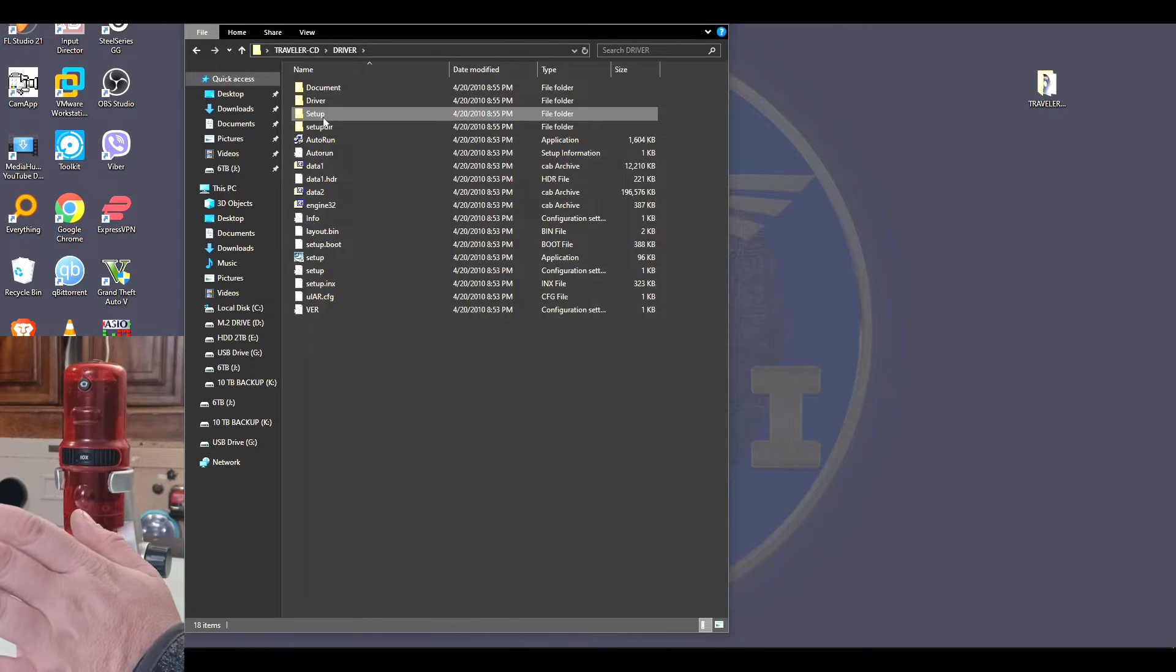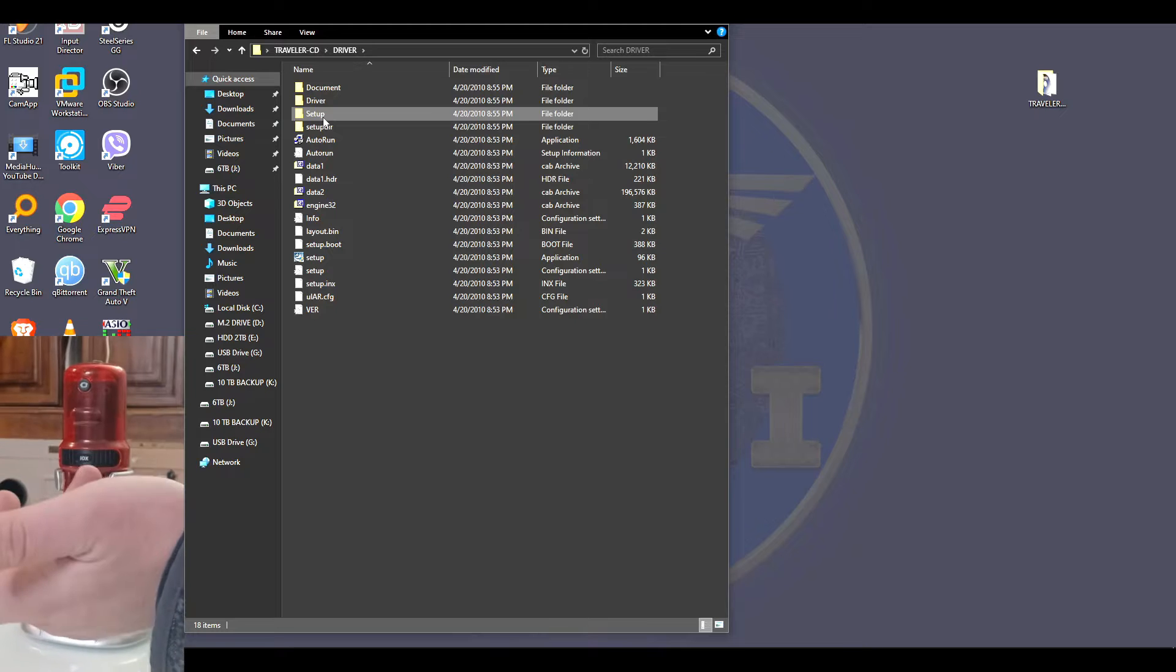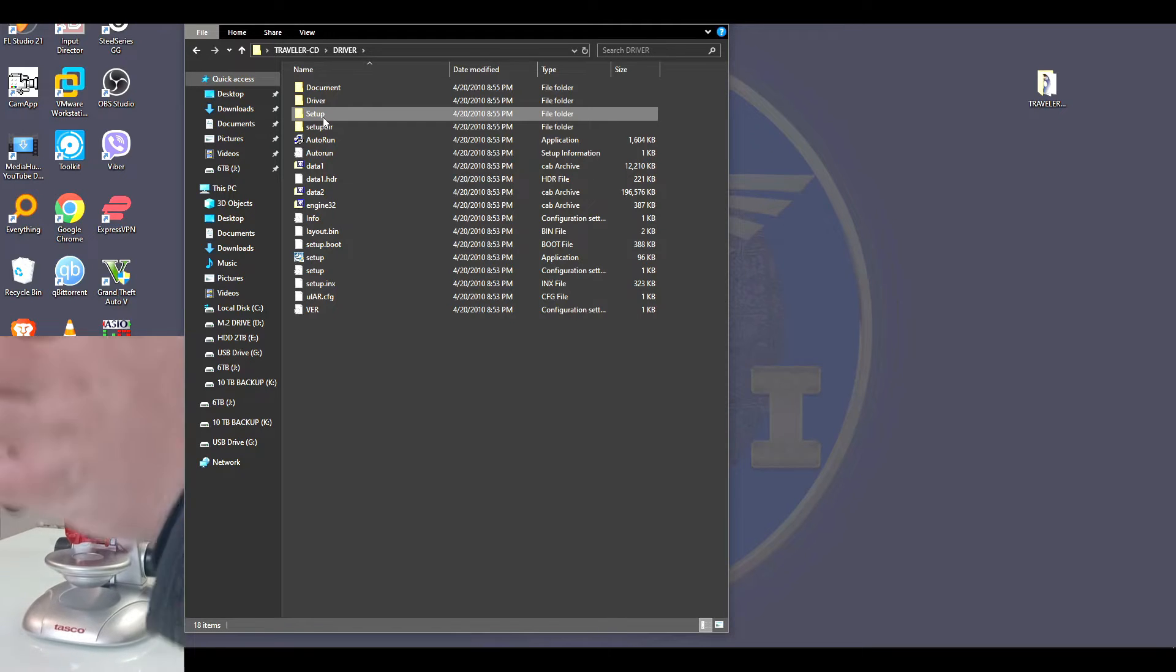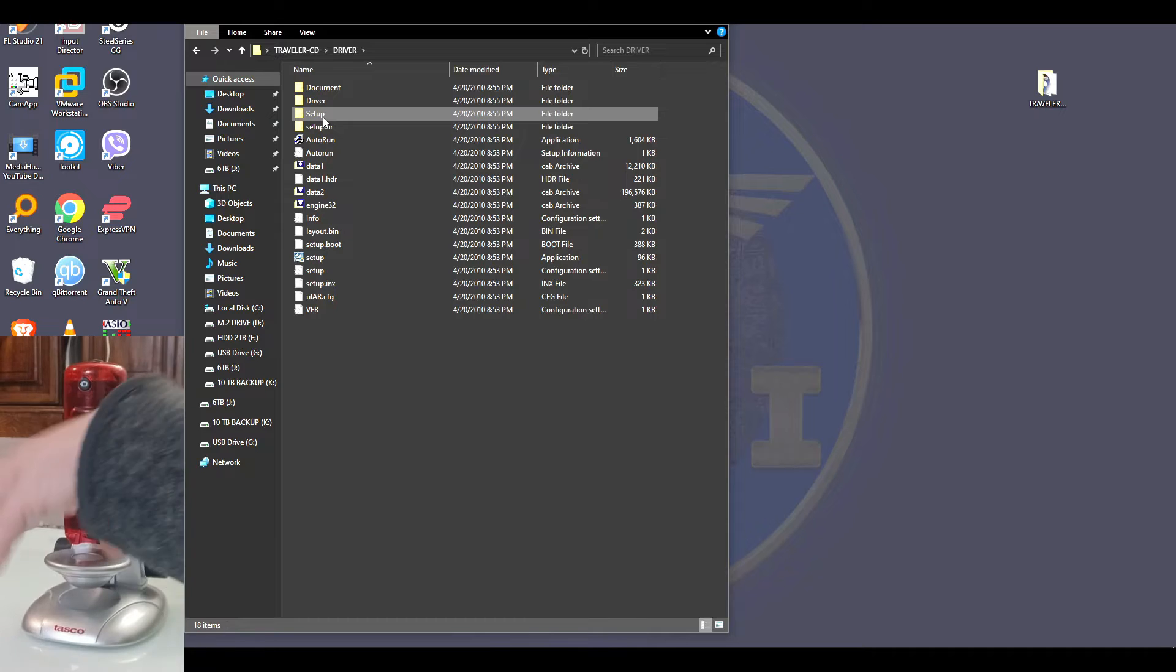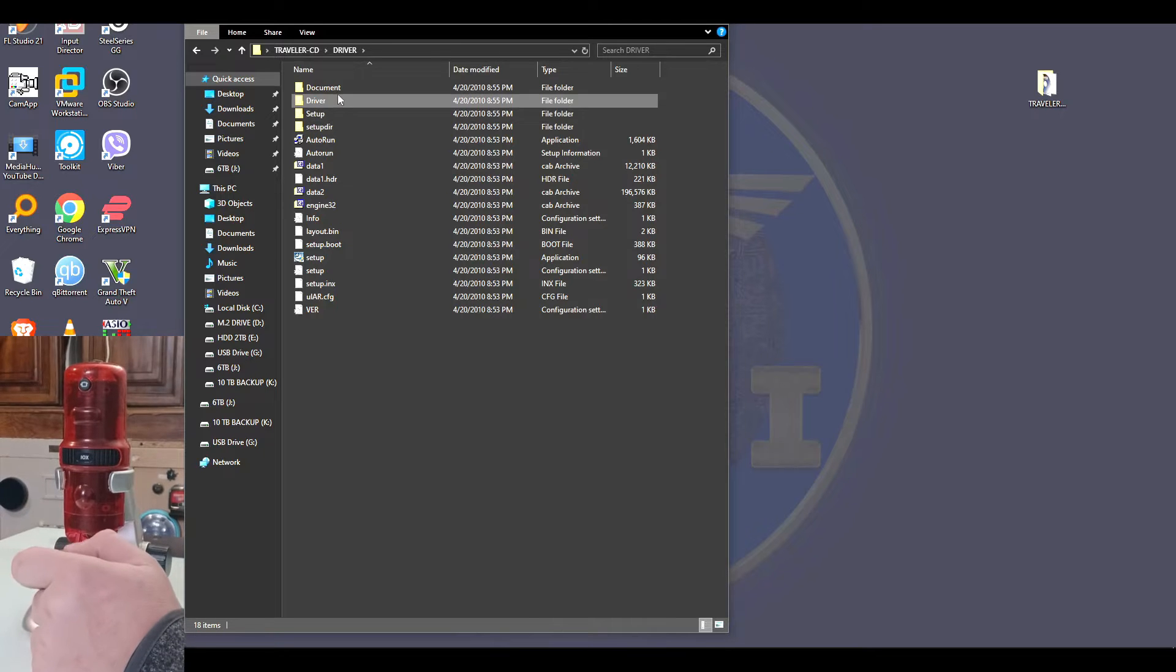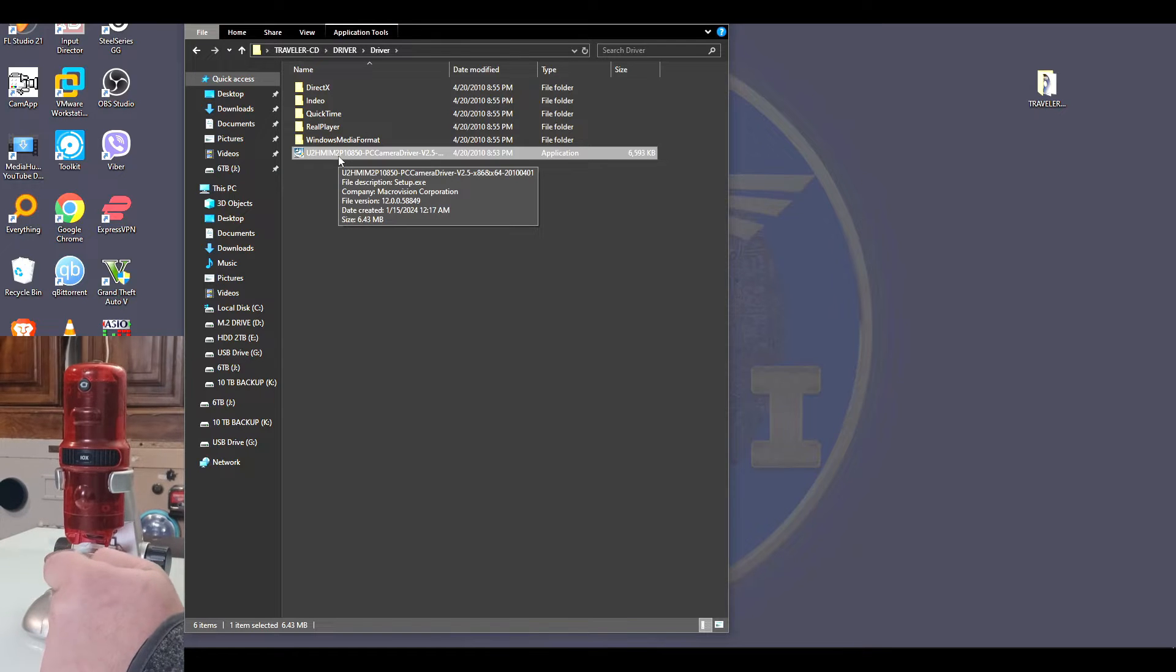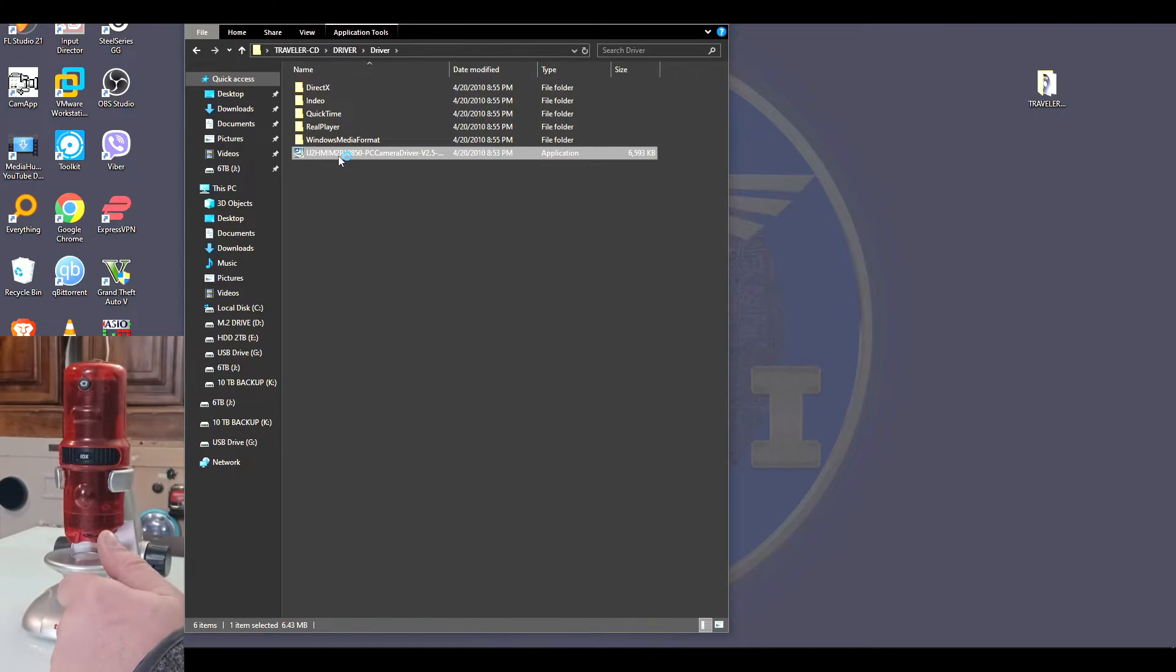After I opened the folder, all I installed to make it work - yes, there's a lot of bells and whistles here that you can tinker with and install other stuff - but to make it work on my Windows 10, yes it is updated to the latest Windows 10, I simply went to driver and installed this file right here. That is literally all I did.